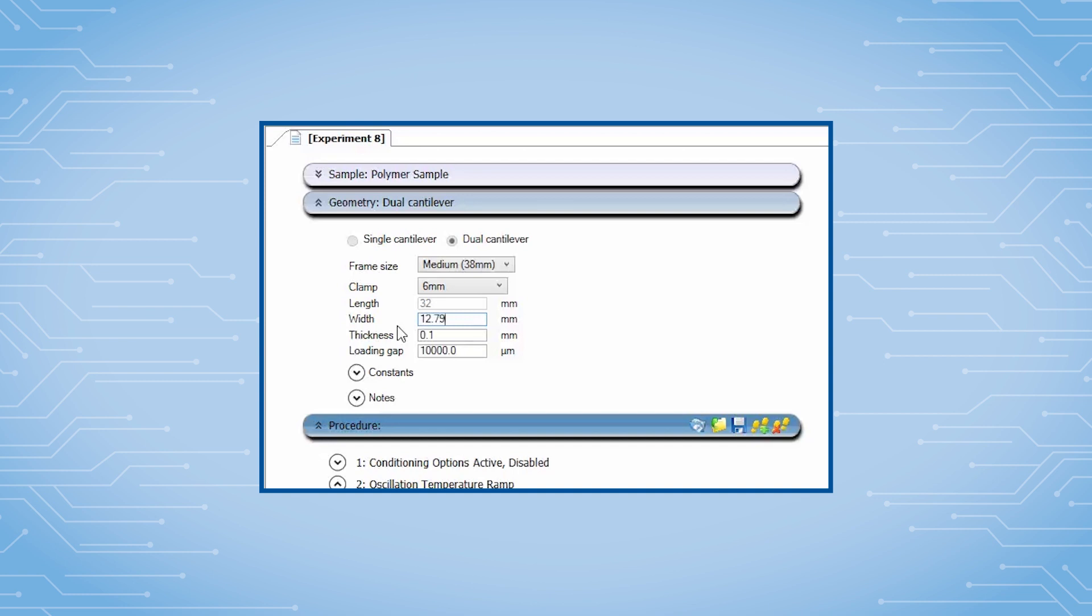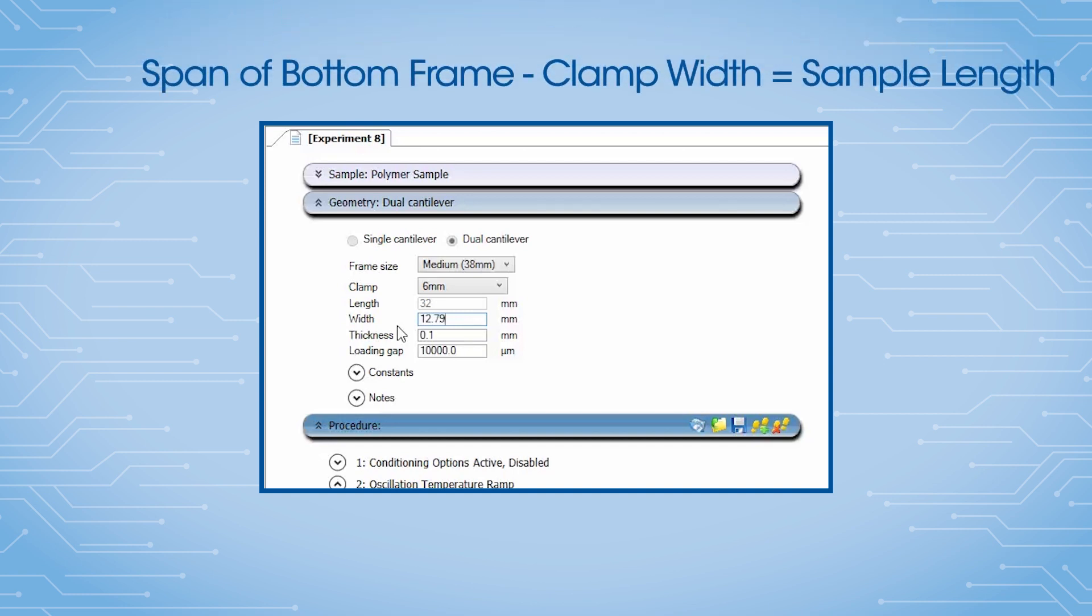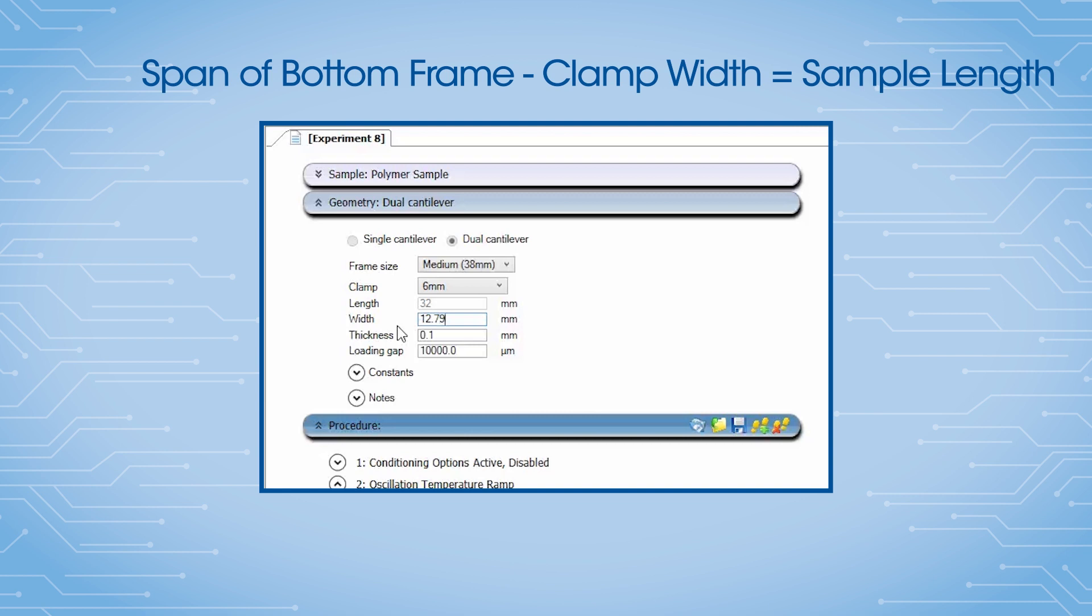The sample length is determined from the span of the bottom frame minus the width of the center clamp. A single cantilever simply uses half of the dual cantilever clamp frame.